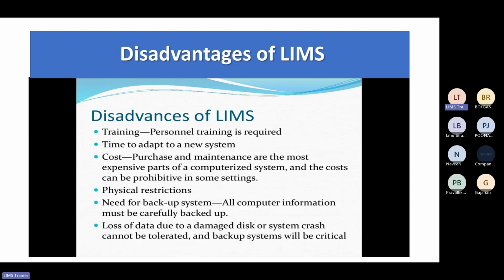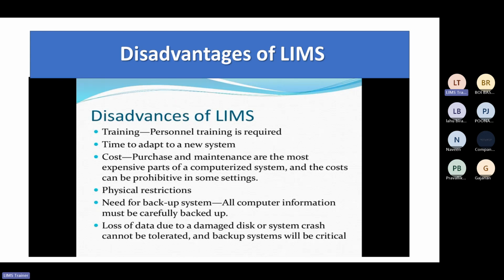But consider one small laboratory which in manual mode is working only for 5 hours in a day, and there the software is implemented. In such a case, it will be a huge cost for that laboratory, right? Because the work is already less in that laboratory. So it will be a high cost for that particular laboratory. This is how the cost is calculated, whether it is benefiting that particular laboratory or not. That is calculated before starting the project.